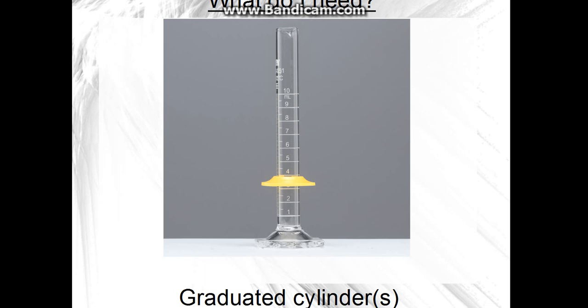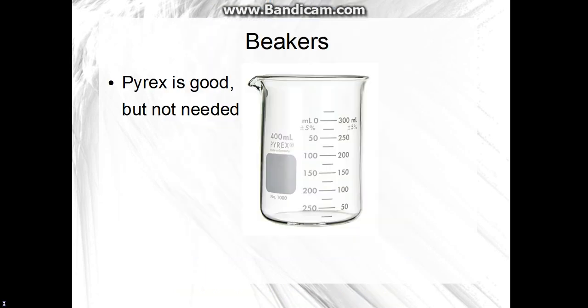You will need graduated cylinders. I don't have any of these rubber bases — they keep it from breaking if it falls over — but those are good to have. You will need several of these. I like the 10mL ones the best, because I measure in small amounts usually. You'll need beakers. Pyrex is a good brand, but you do not need Pyrex because they're really expensive.